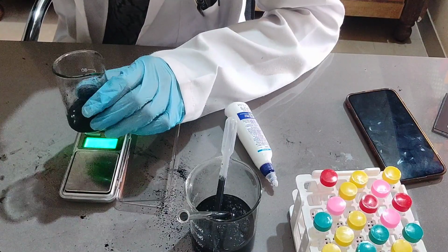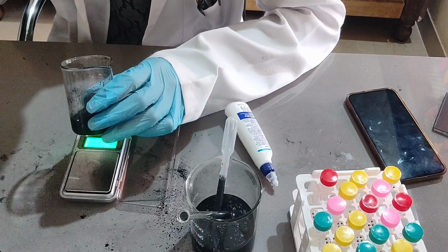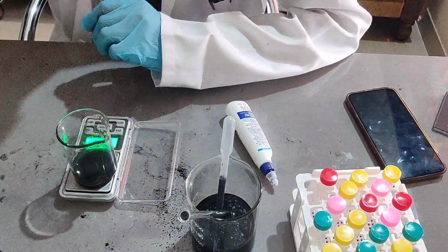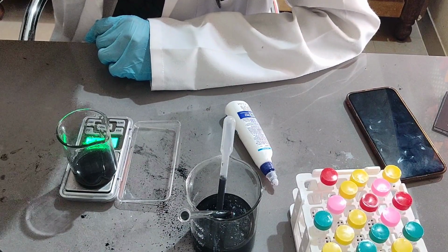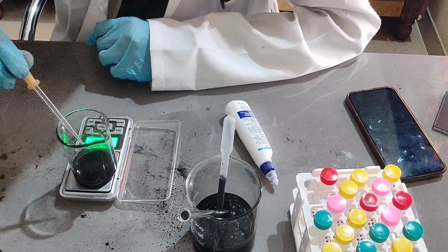Even without adding any kind of water, this suspension is just so much better than what we had before, but we are of course going to add a little bit of water, because you have to control how fast the acetone dries out.